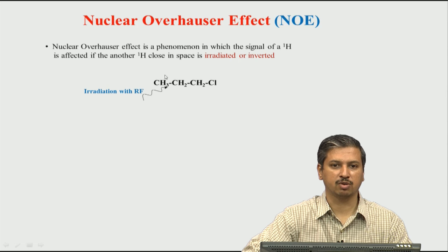We saw that when you do not apply a pulse, there is the Boltzmann distribution of population, the equilibrium, but when you apply a pulse the populations become equal. We say the two levels are saturated, meaning the populations are equalized, so there is no more population difference. That polarization, which is now zero, starts going back towards equilibrium when you remove the pulse.